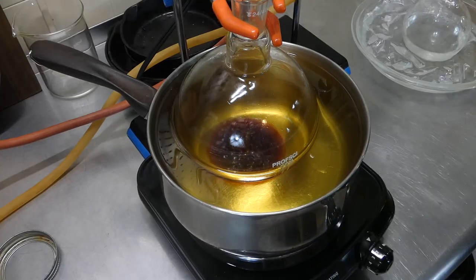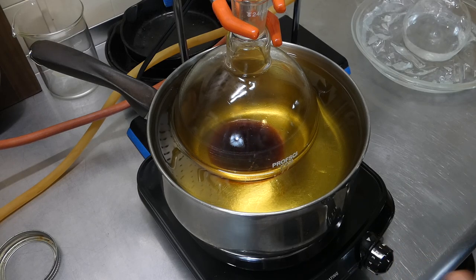Okay, this is pretty close to being done. I'm going to stop the distillation now because this stuff gets really gloopy and hard to work with once there's no more ethanol in it. While there's still a little bit of ethanol left in there, I'm going to take it out and transfer it to another container and we'll go from there.